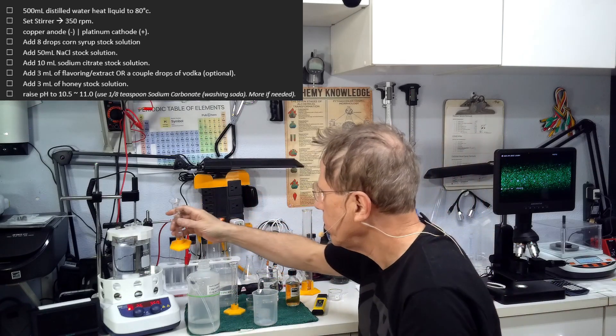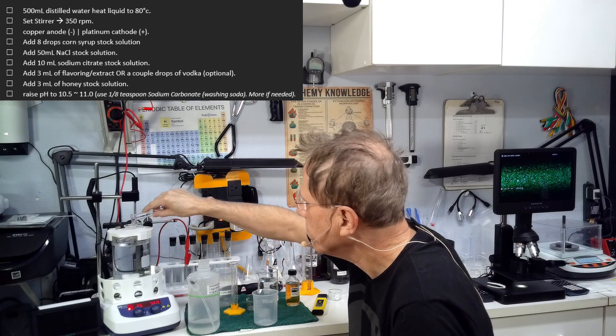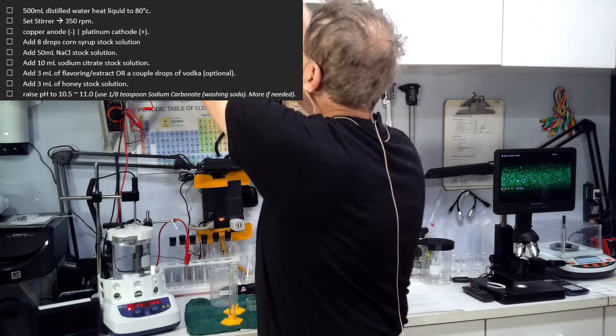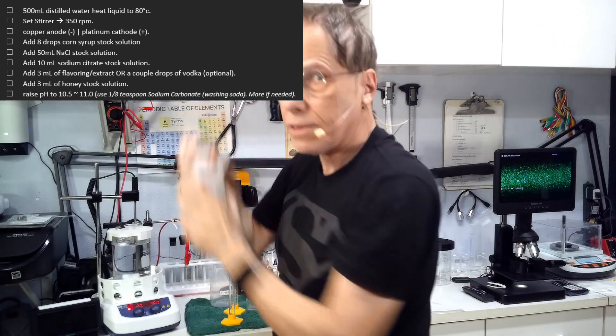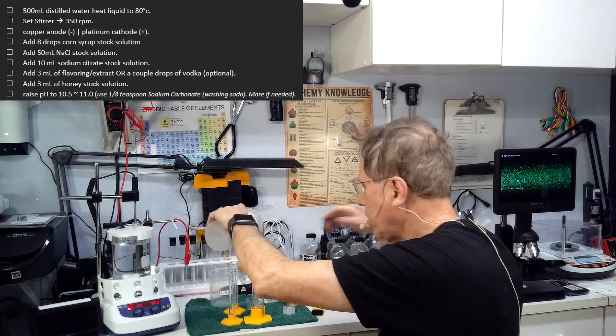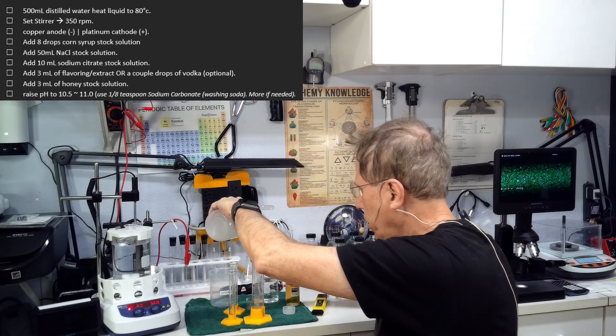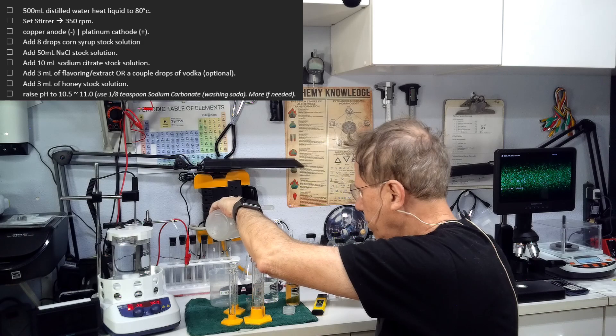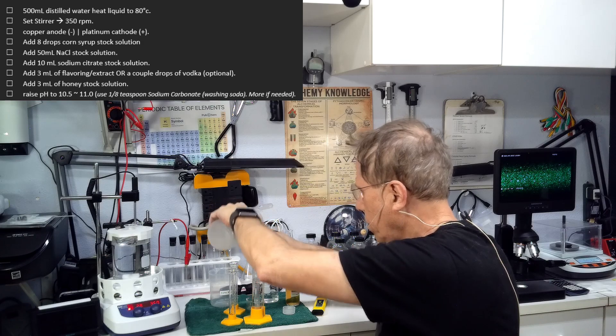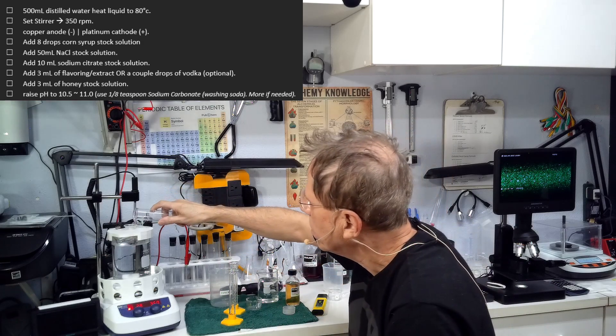First we're going to start with the gold formula. The gold formula calls for using our stock solutions, 10 milliliters of sodium citrate is going to go in there. Next NaCl, we're going to put 50 milliliters.